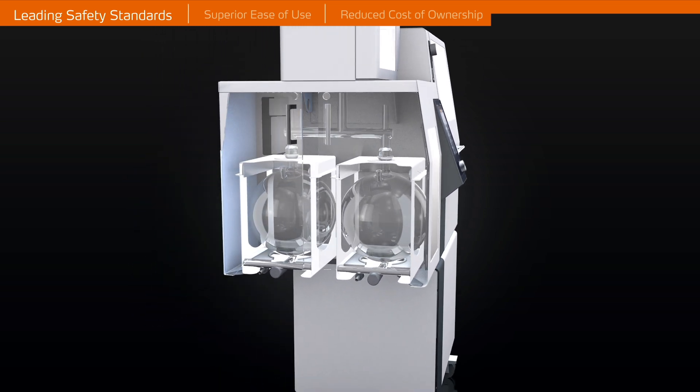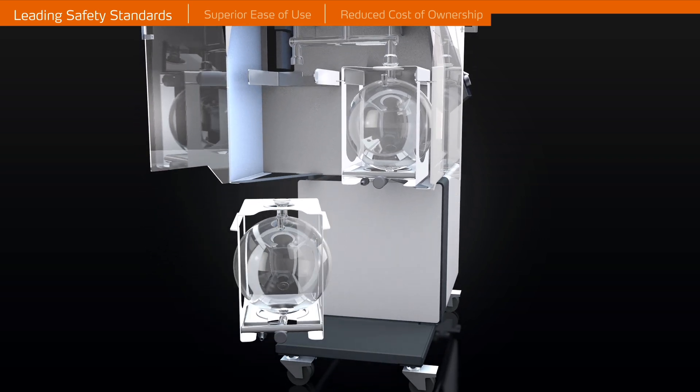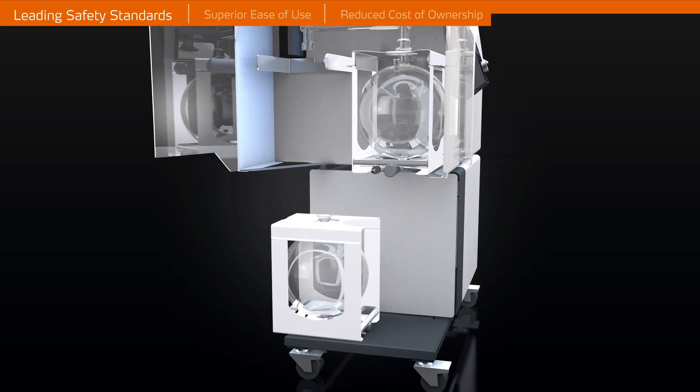The Unique Receiving Flask Cassette System is a metal housing that fully contains the glass flasks and allows for safe transport, handling, and storage of the receiving flasks. The Unique Receiving Flask Cassette System is further protected with PMMA safety doors.